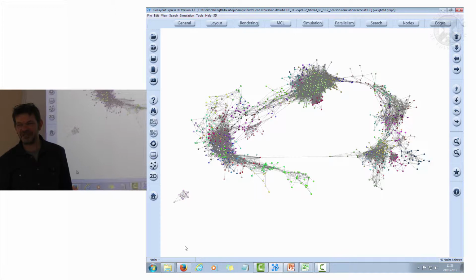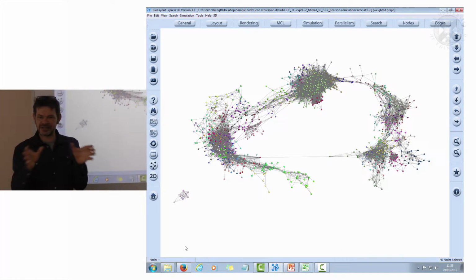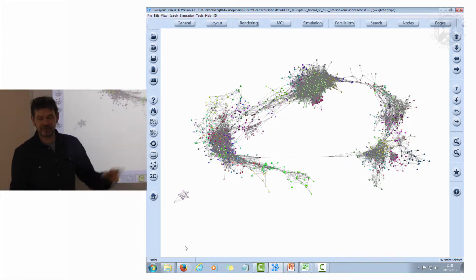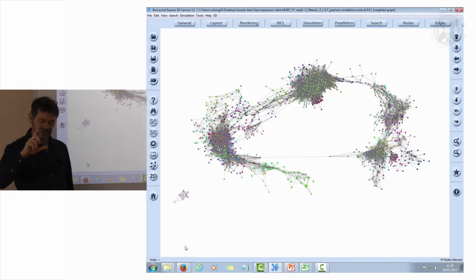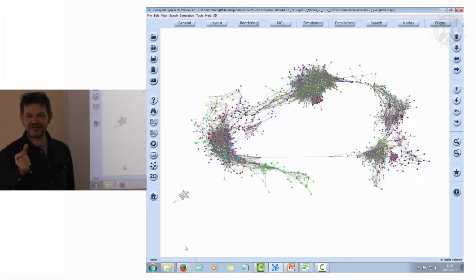These genes are not interesting. Their expression pattern is changed purely because the data was different when we started. In that second experiment, which was run on a series of 4 strip chips, one of the strip of chips worked differently. Again, there's a set of genes which are highly expressed in those 4 there.